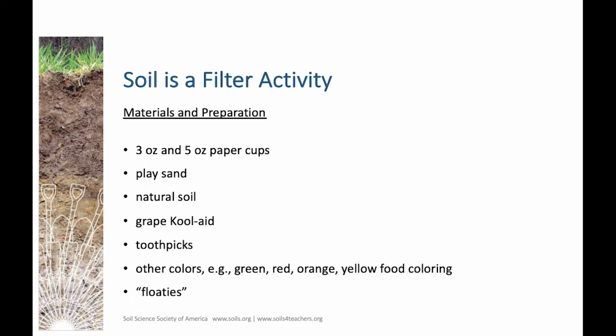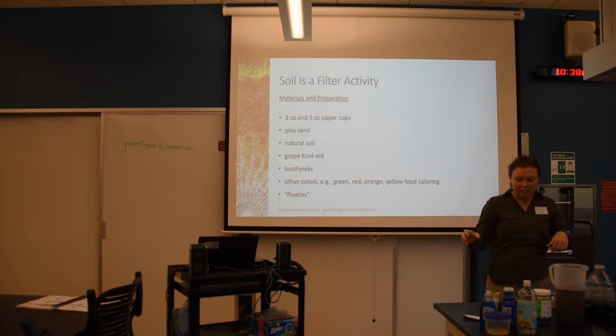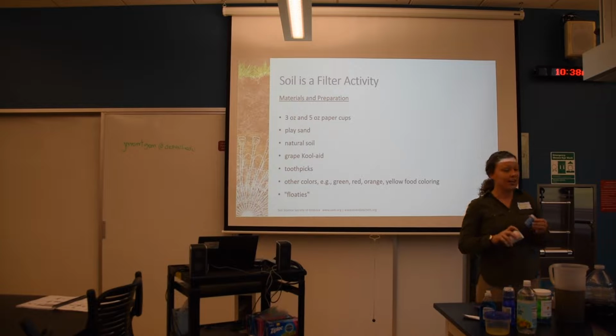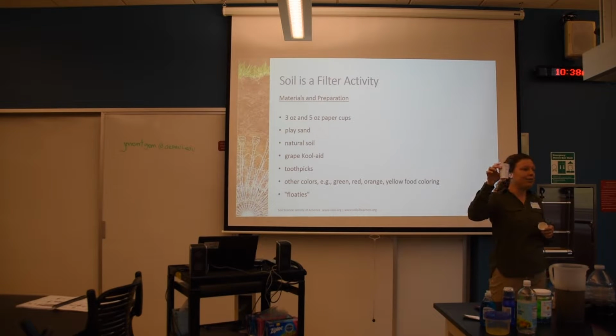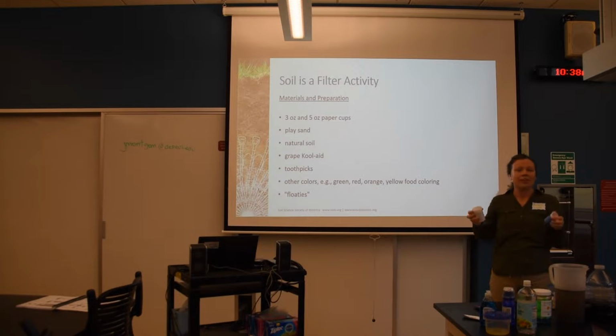So for this activity, I'm going to have you work in groups of 2 or 3. I wouldn't get any bigger than 3 because it's going to be a little tight. But the things that you're going to need for this activity are in your bucket. So you should each have some 5-ounce Dixie cups and some 3-ounce Dixie cups. We are going to need 4 of each. So you can split it up amongst yourselves, or one person can use all of your cups.